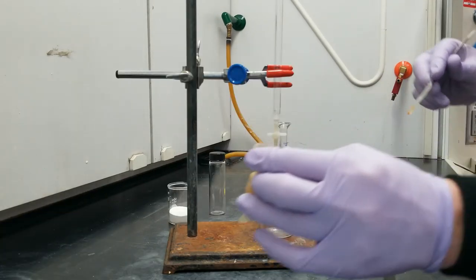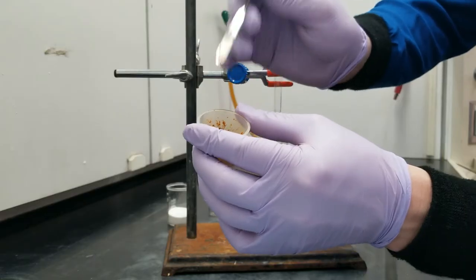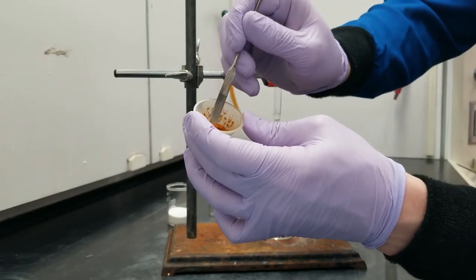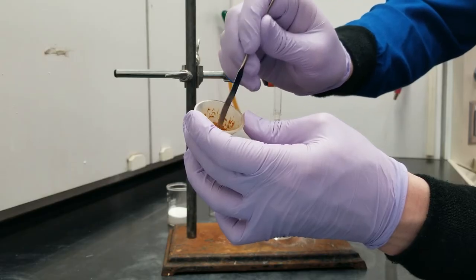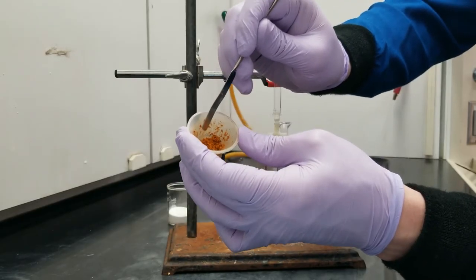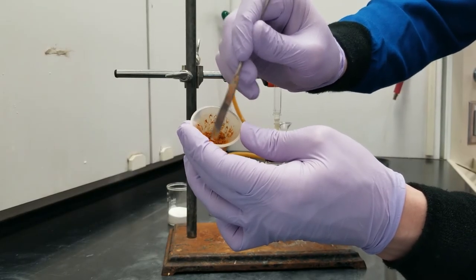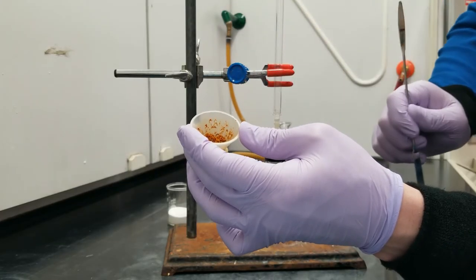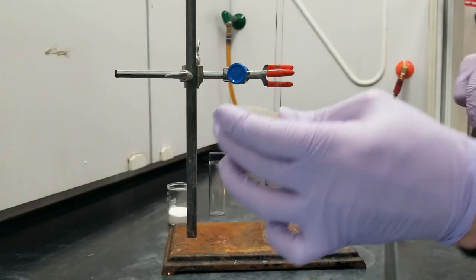Okay. So, we've let this dry for several more minutes on the best vacuum in the lab, and what we have now is kind of a sandy combination of acetyl ferrocene and ferrocene. So, this is now dry enough that we can separate it by column chromatography.